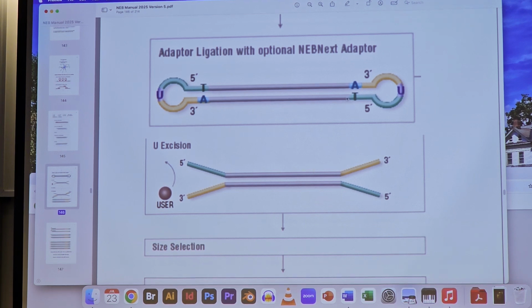If we're going to count that way, it's actually 4 ligations, because we have to ligate here, we have to ligate there, we have to ligate here, and we have to ligate there, right? So it's 4 ligation events, but it's only one reaction we have to run. We only have to run one reaction with one molecule added, and that's this one adapter. And that's going to generate then for us 2 separate ends.